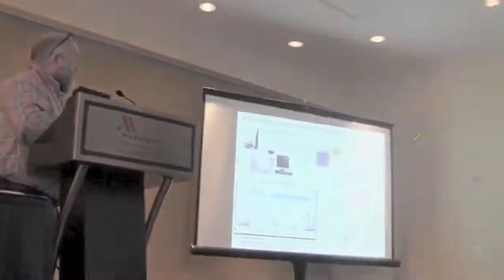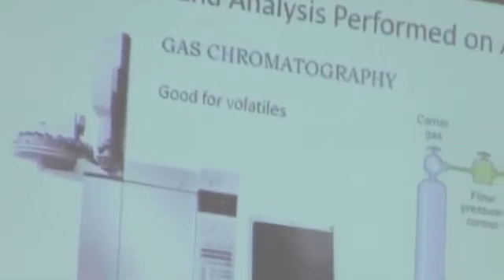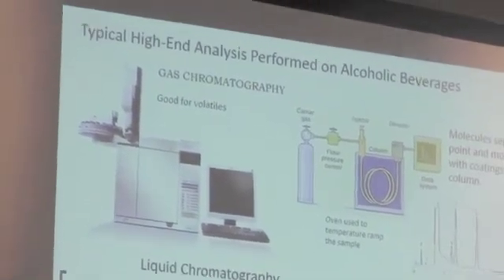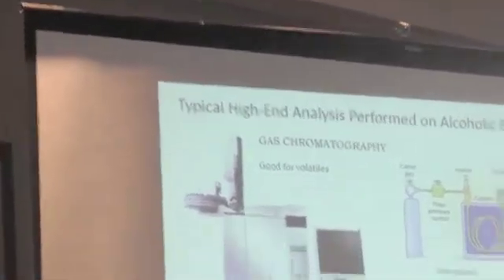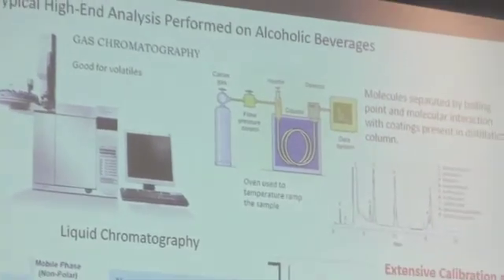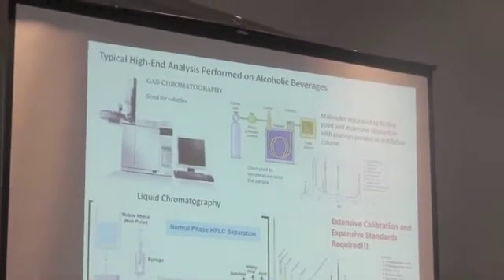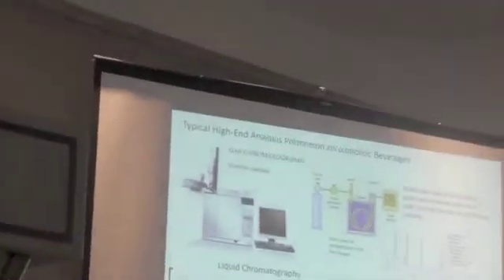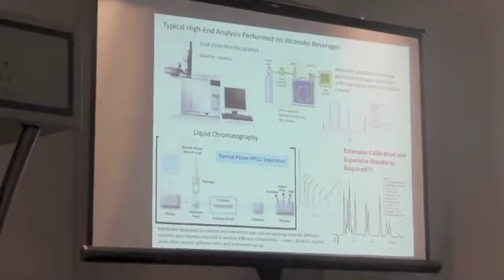So, some of the competing technologies, I don't know much about the Foss wine screener, which is one analysis that you could use, an infrared technology. But it's very correlative. They have to do other tests and then correlate the results of the infrared to those other tests to then give you the numbers that you get out of that machine. There are other techniques like GC that is very good for volatiles, for example, the olfactory things, the sensory things, that's what that analyzer is good for. And then also HPLC, liquid chromatography, is good for organic acids, sugars, things like that.